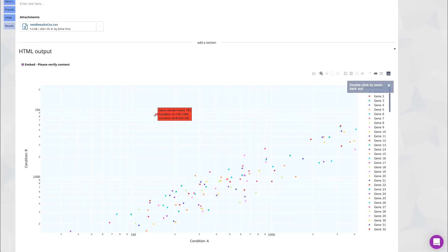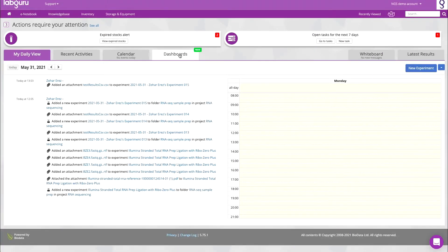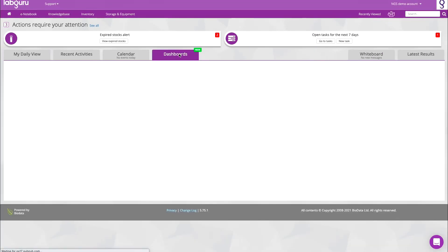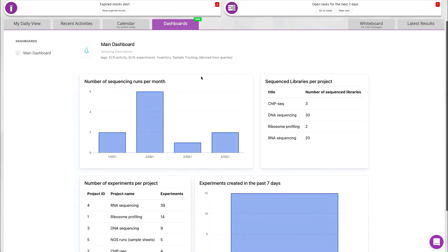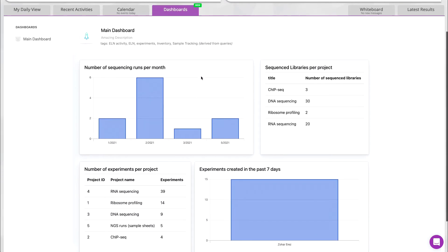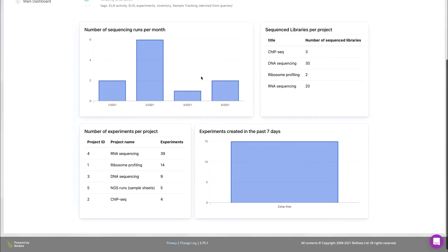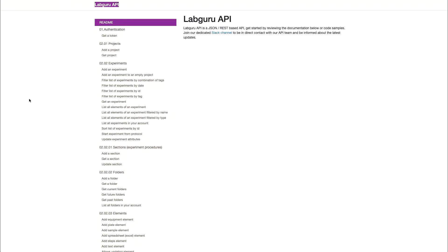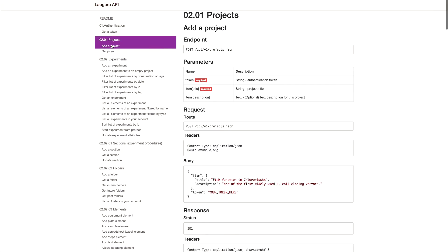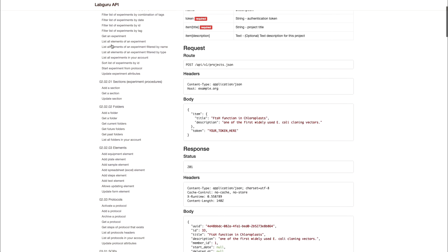These analysis scripts can even be set to run automatically. LabGuru helps you structure data from all formats and sources, visualizing it in tables and graphs to help you derive results and make data-driven decisions. If necessary, LabGuru can also integrate with your personal analysis software.